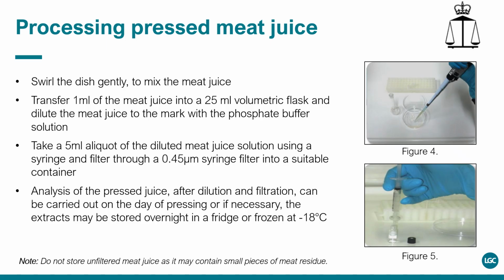It should be noted that analysis of the pressed juice after dilution and filtration may be carried out on the day of pressing, or if necessary, the extracts may be stored overnight in a fridge or may be frozen at -18 degrees C. It is not advised to store unfiltered juice as it may contain small pieces of meat residue.